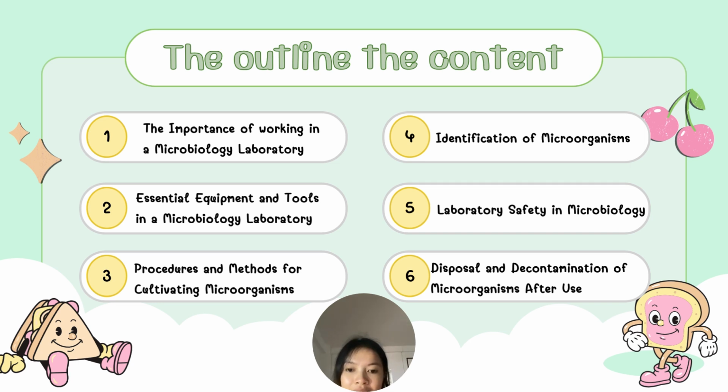We'll start by the importance of working in a microbiology laboratory. Then we'll look at essential equipment and tools in a microbiology laboratory. Next, we explain about procedures and methods for cultivating microorganisms. Later, we show you how to identify microorganisms. After that, we would like to deal with laboratory safety in microbiology. And finally, I will discuss disposal and decontamination of microorganisms after use.